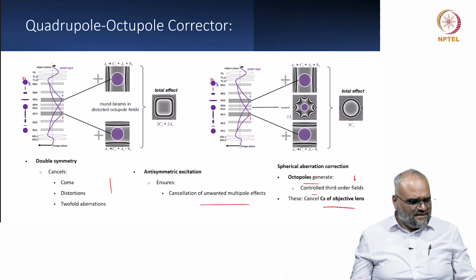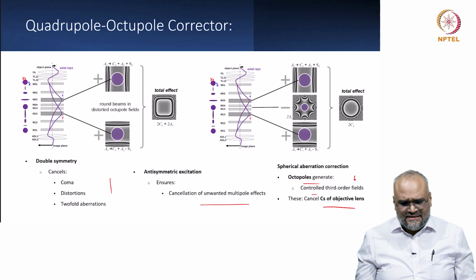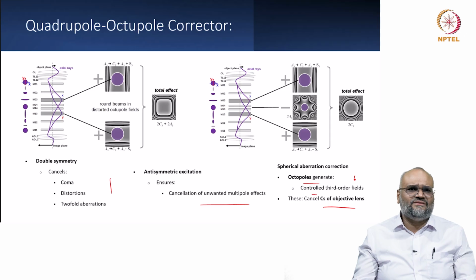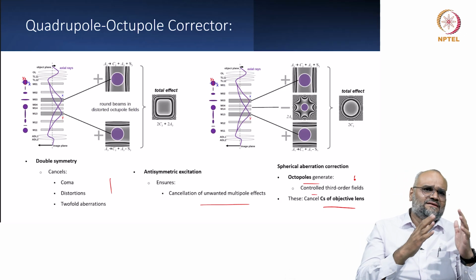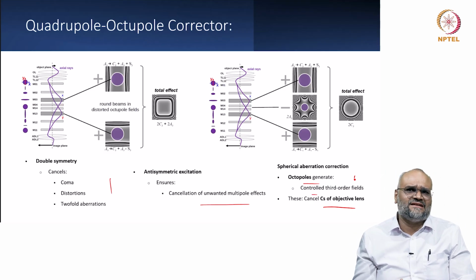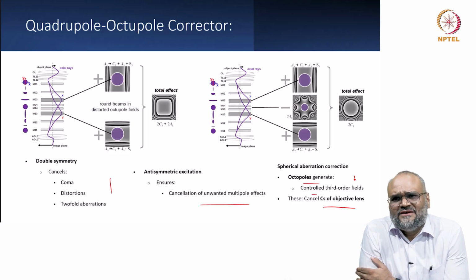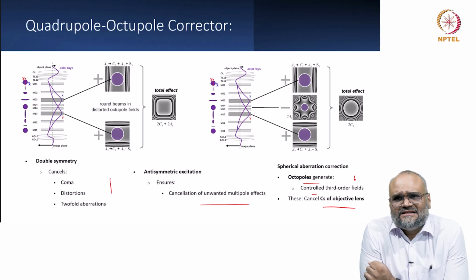So, with this you break the 1 angstrom resolution barrier and you achieve very good resolution, and with the feedback control and the very good electronic stability of these components, it has become more or less a standard practice these days, with installations of electron microscopes with spherical aberration correction, and there are very few installations with chromatic aberration correction as well. This quadrupole octopole kind of a corrector is very commonly found for the NION systems, which are exceptional for spectroscopy studies as well.